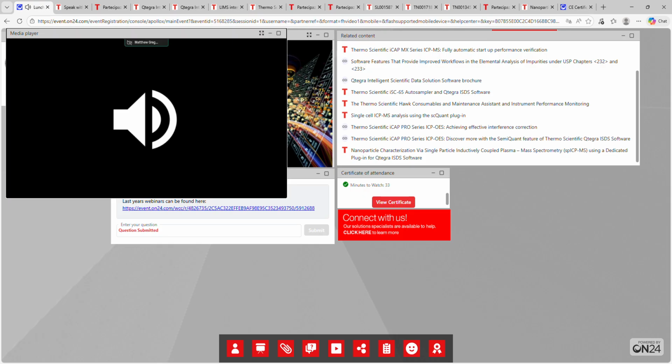If it's a parameter that you want to change for everything, then you're probably better off doing that within the configurator software, and then it changes that globally. So you don't have to keep changing it in every lab book. You can change it in the configurator, then it changes it thereafter. So that's in the evaluation parameters in the configurator.